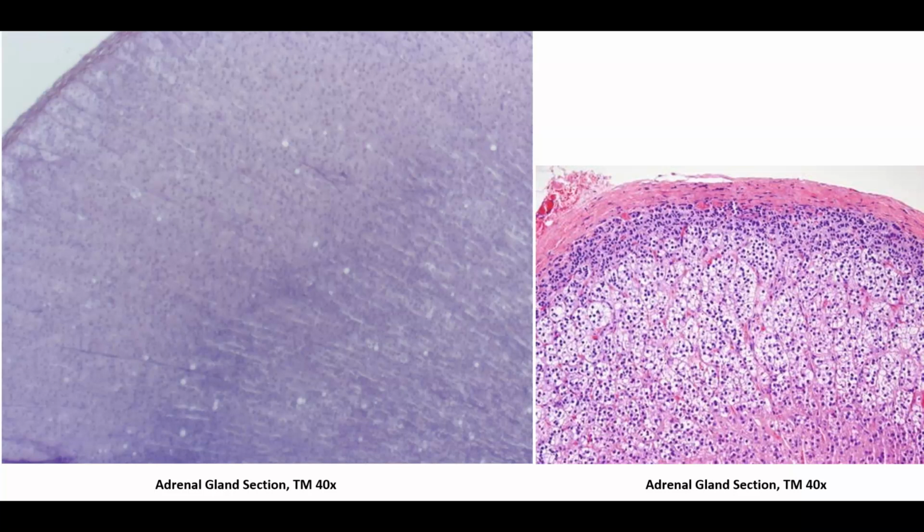Okay, let's take a look at the adrenal gland slides. So you're seeing two sections here from two different adrenal glands stained slightly differently. This is a really large gland, even in a small animal, so it's often quite difficult to see the entire thing in a compound microscope, even at this lowest level of magnification.